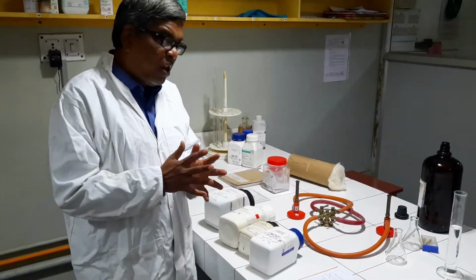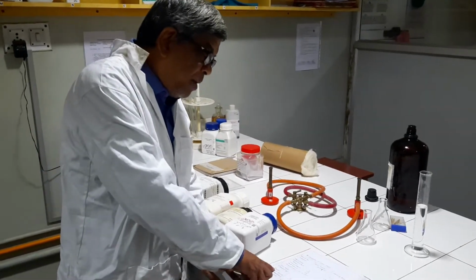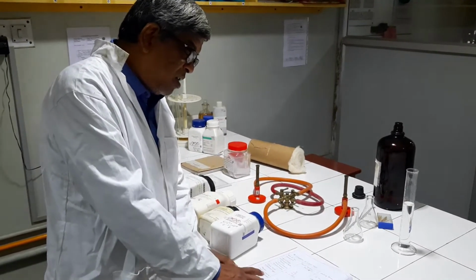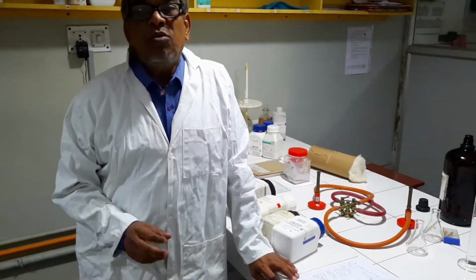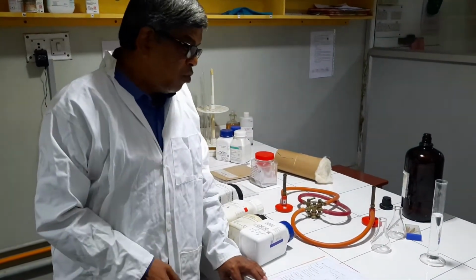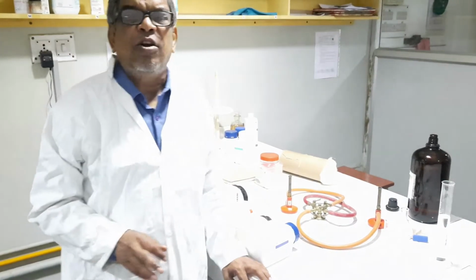In the case of solid media, similar ingredients are there: peptone 1 gram, sodium chloride 500 milligram, beef extract 500 milligram, distilled water QS. But we will have to use a solidifying agent. In the first media, where I said it is peptone, sodium chloride, beef extract in distilled water, I did not mention any other solidifying agent.